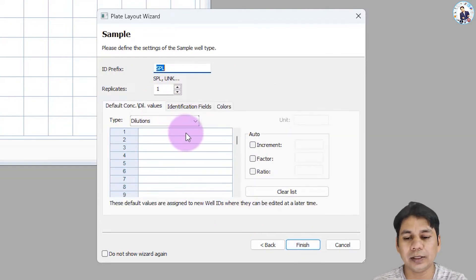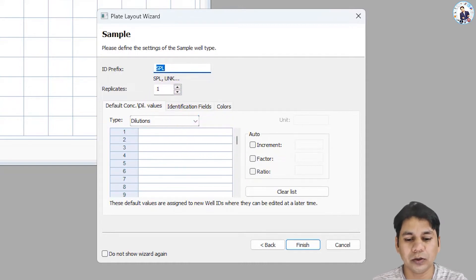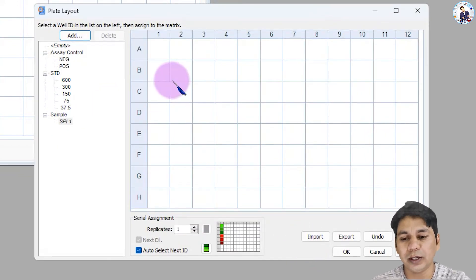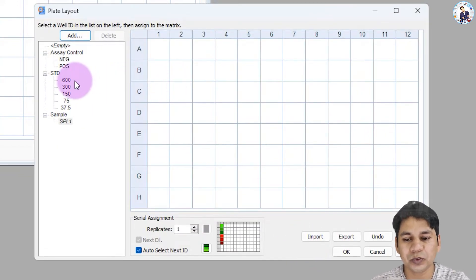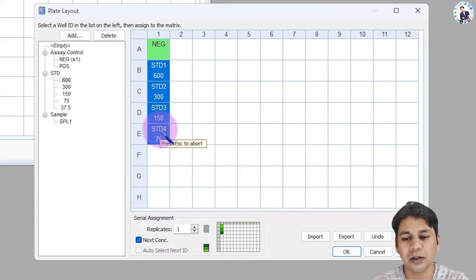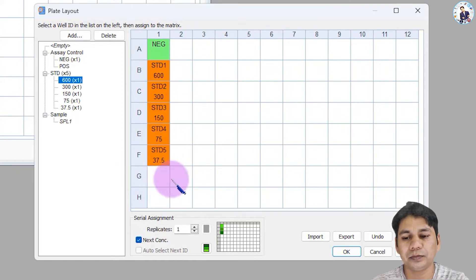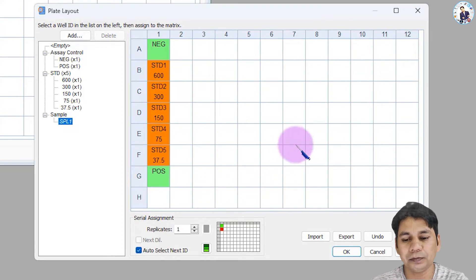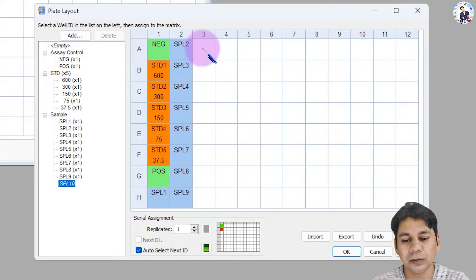You can increase or decrease the sample number during the assigning of the plate layout. I am going to finish this and assign my controls, samples, and standards. In the first well I have the negative control, followed by the standards, and here I have the positive control in this well.